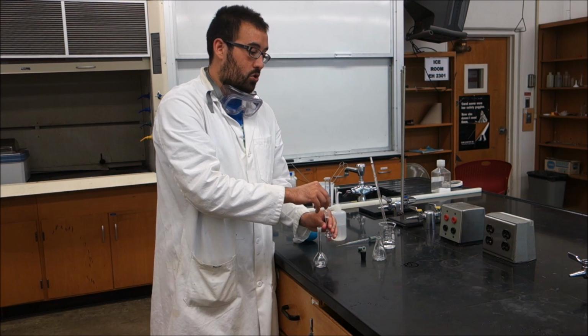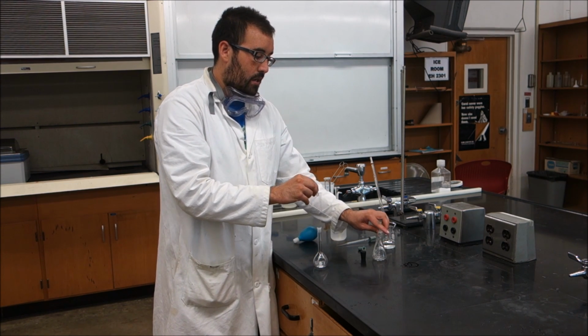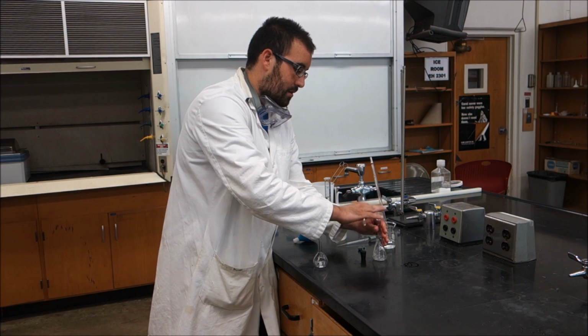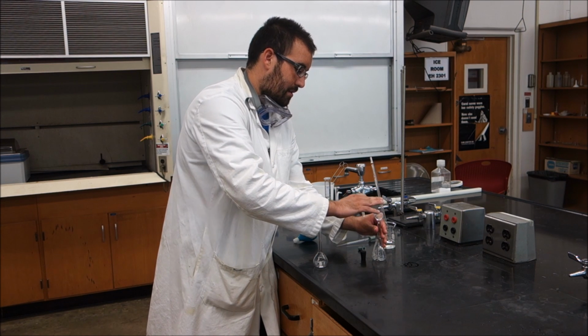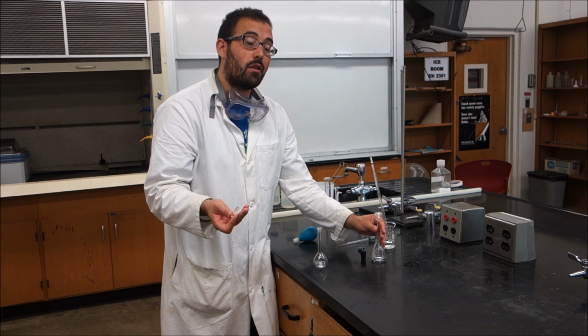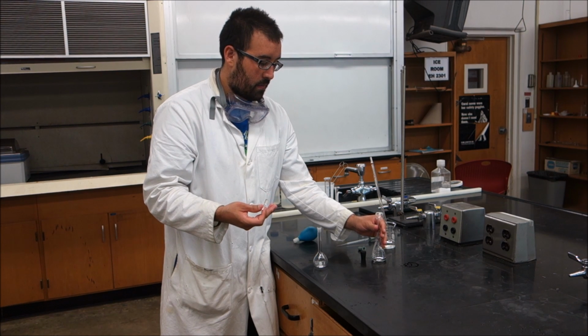We'll open it up and we'll transfer it into a container. Sometimes it gets a little stuck here, so we'll have to give it a gentle little tap to get the liquid flowing into our other container. This could be an Erlenmeyer flask or a beaker.